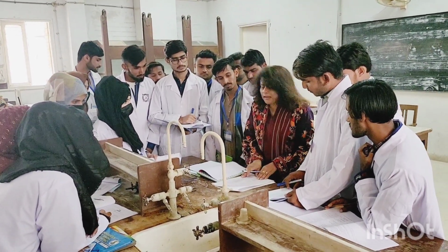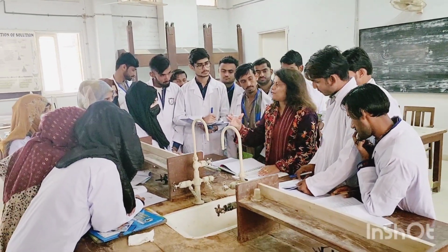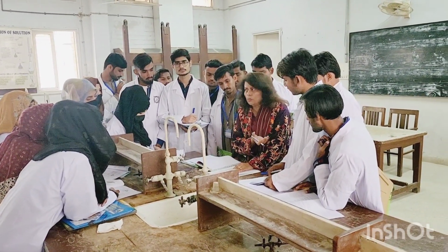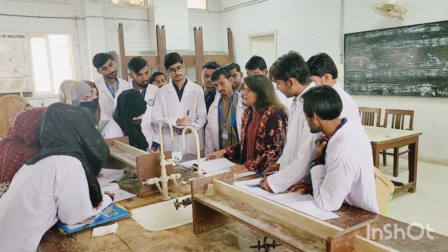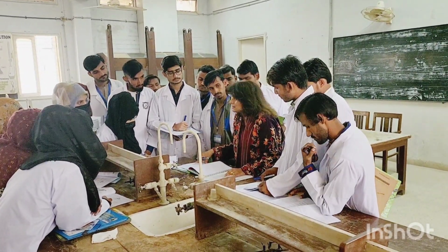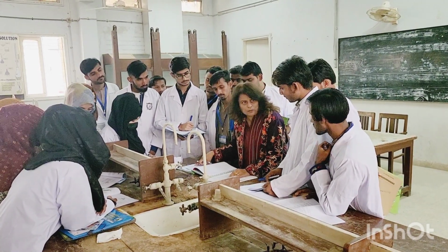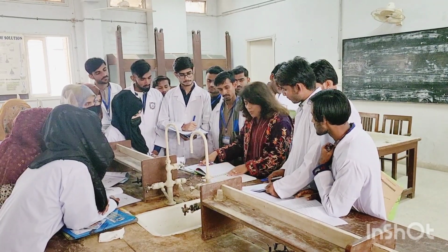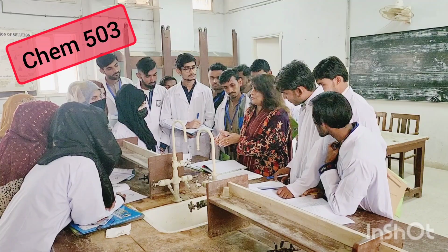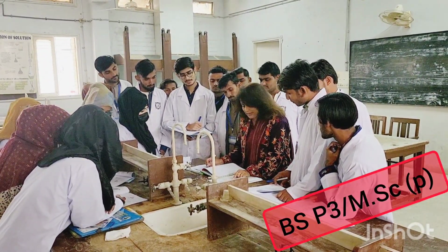You will not write everything from here, but you will progress in the forward direction by looking into the compound that has been provided to you. And then you are going to write down your observation, and according to your observation, you are going to write down the results. Your results depend on your observation. You don't have to write down each and everything from here. No, you will select what you are observing for your compound. Okay, so here you will write that.